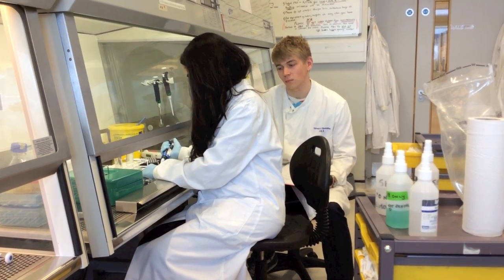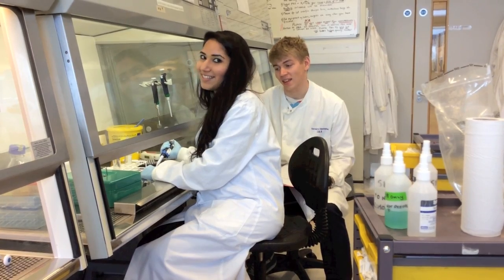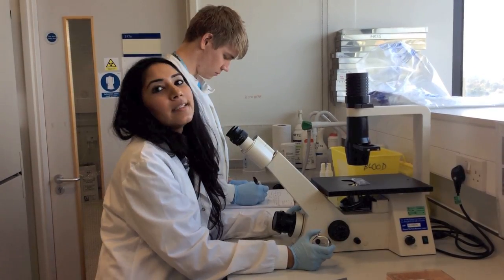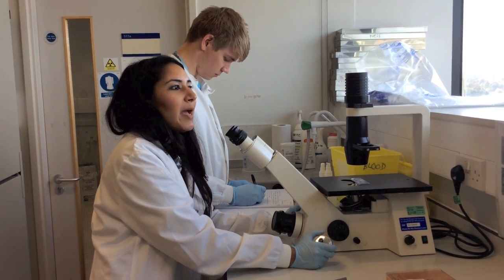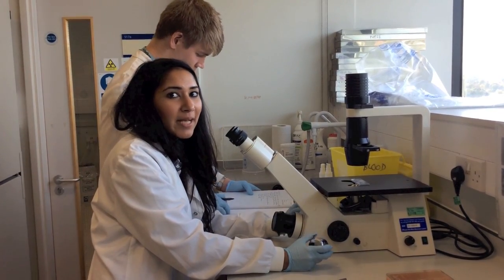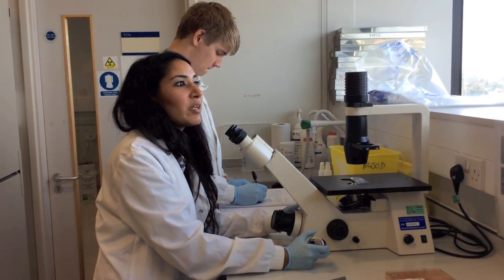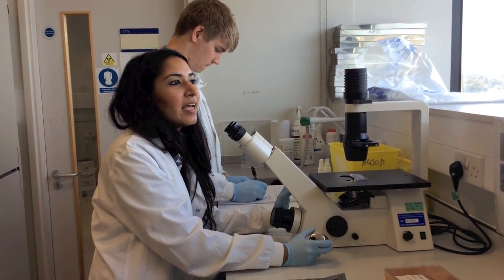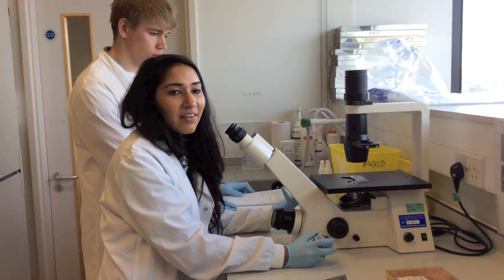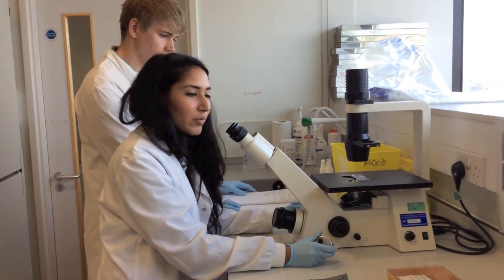And Ben, you're helping out? I'm learning and sort of helping out here, yeah. He's my assistant. I am, exactly. Do you usually get a lot of B cells out of normal liver? It depends. Some livers it can be 16 million and some can be 60. It just depends on the size of the tissue that we receive. And what we're trying to see is if their disease contributes to the number of B cells that there are. So in certain diseases you may get more.